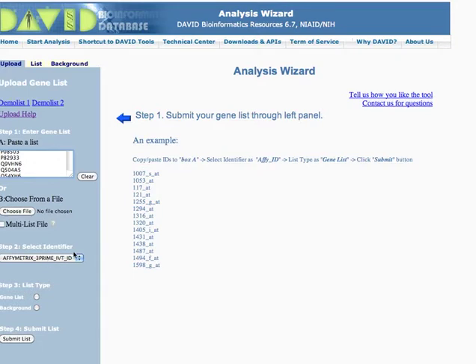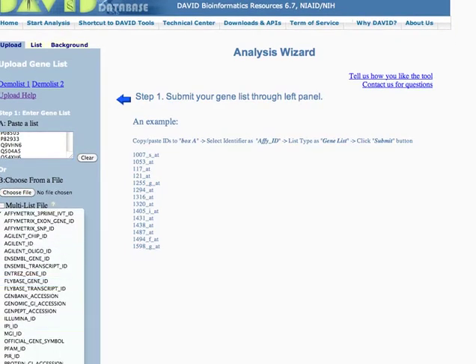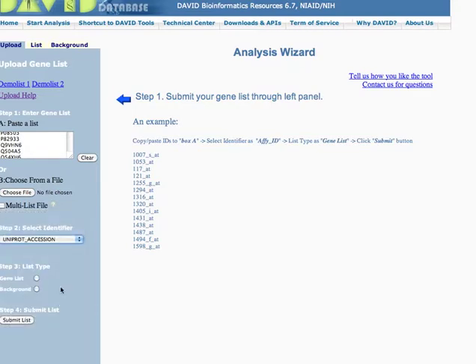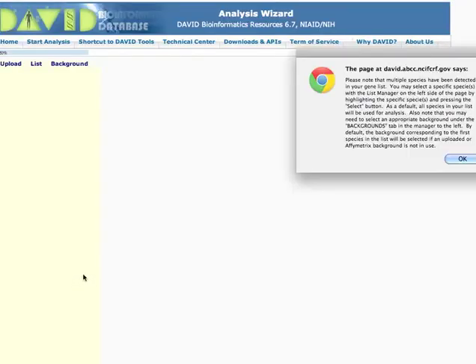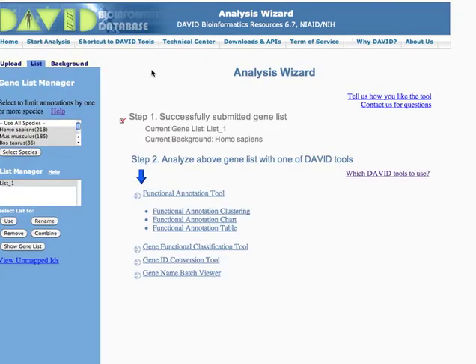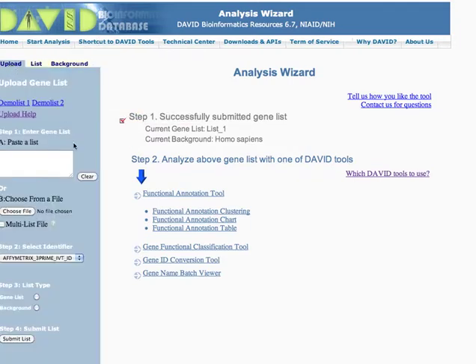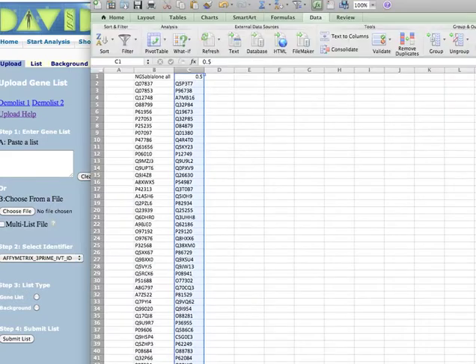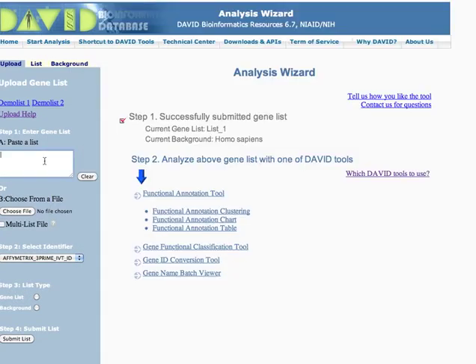So the first thing I'm going to do is, this is a Swiss-Prot UniProt accession number. And I'm going to do that. That's your gene list. And now I'm going to upload the background, so everything that's being expressed.